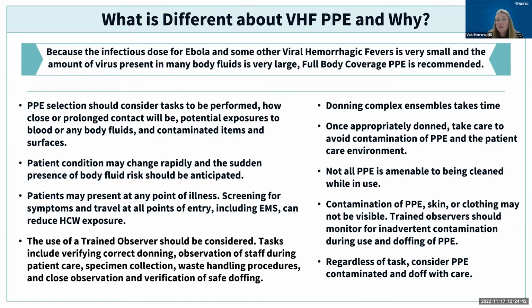So trained observers or partners should monitor for inadvertent contamination during the use and doffing of the PPE. Regardless of your task, consider the PPE contaminated and doff with care. This is very important. Next slide, please.